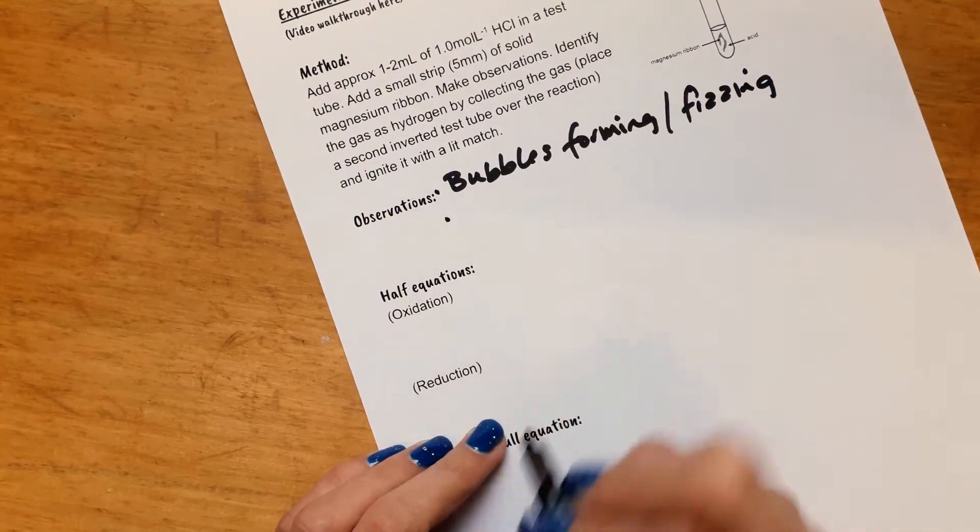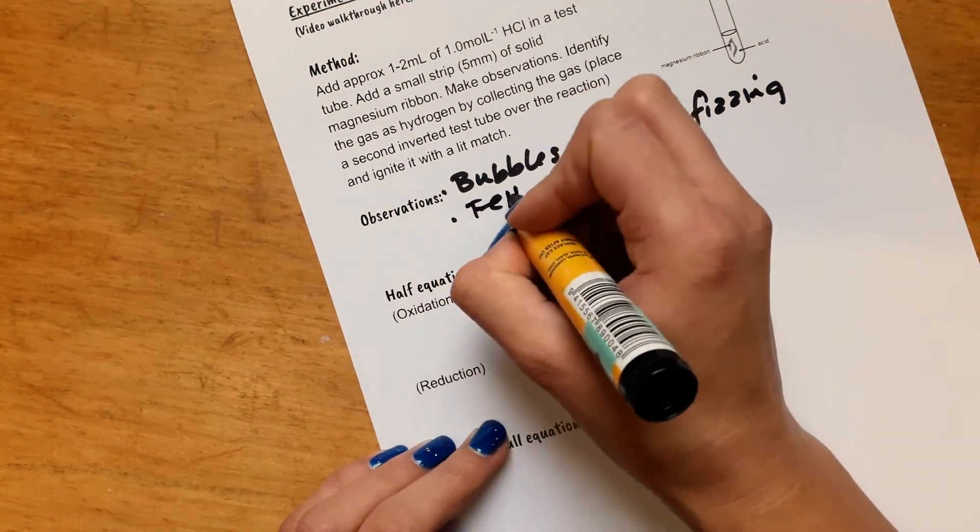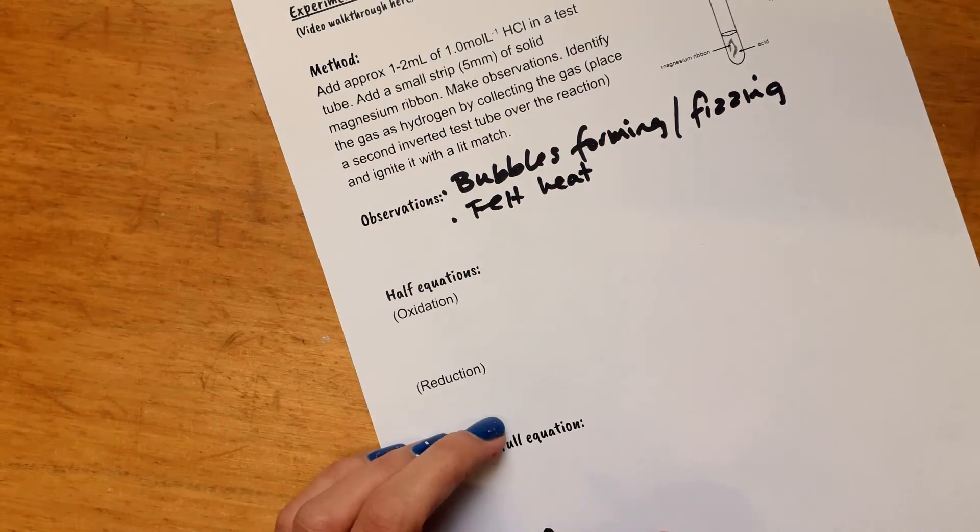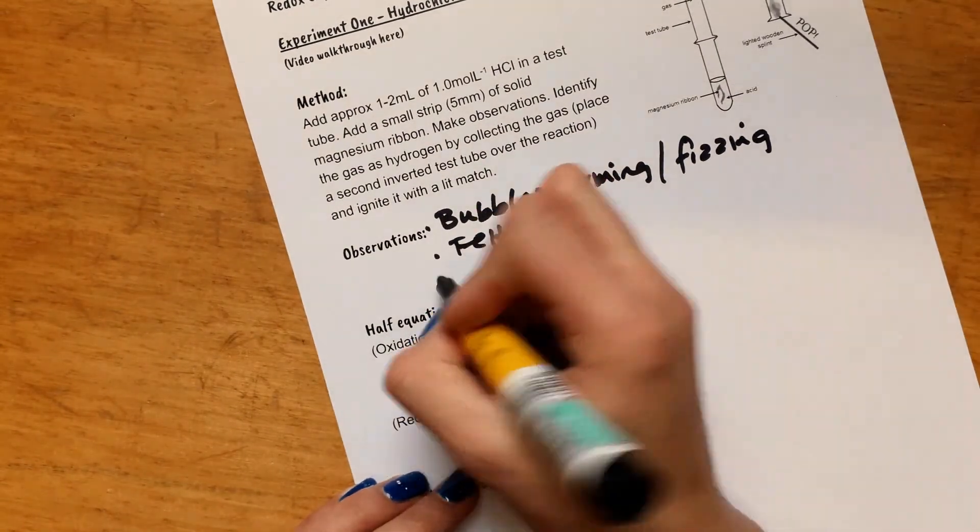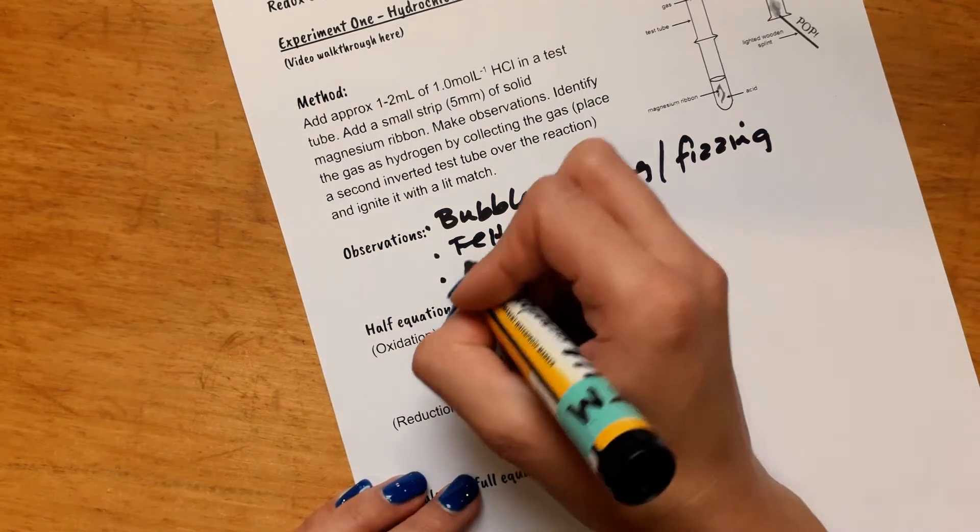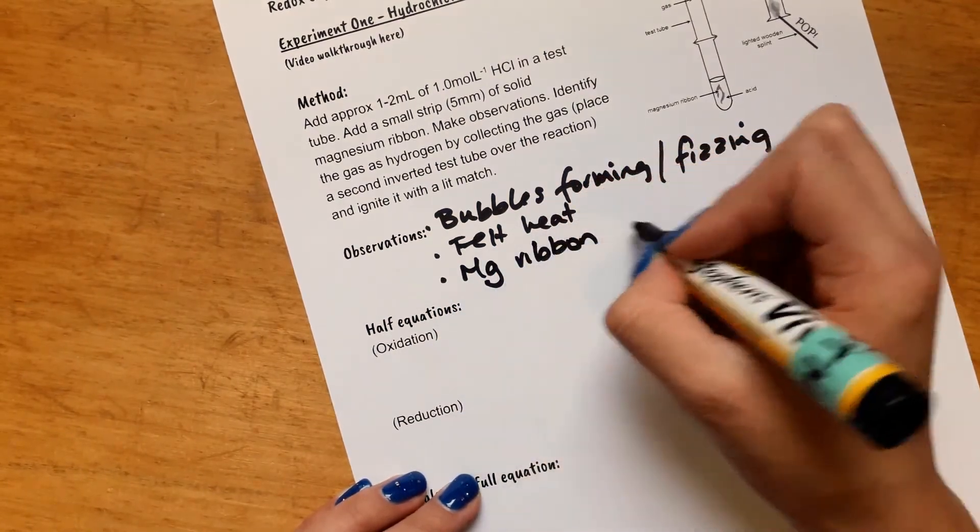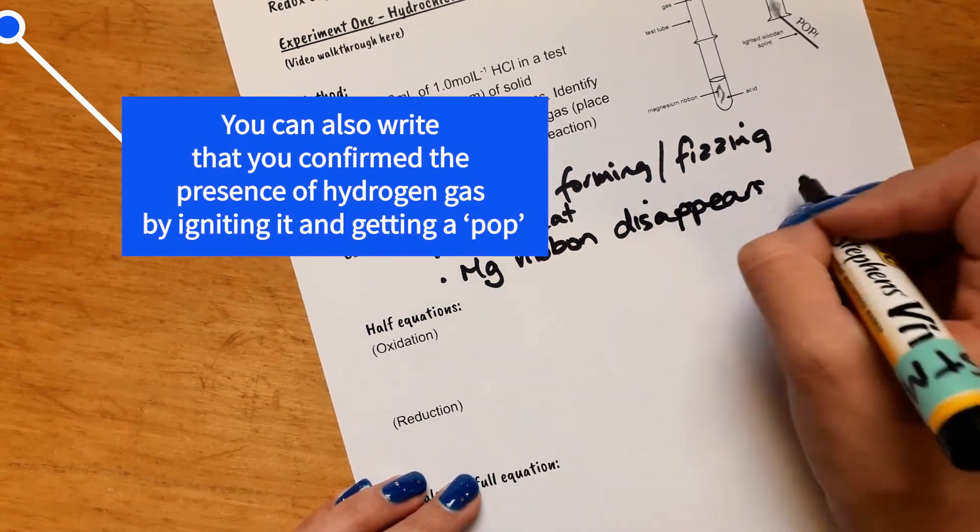And you also would see that the magnesium looks like it's disappearing. So you don't say dissolved because it's actually reacting. So you can just say what you see is that the magnesium ribbon disappears. Cool.